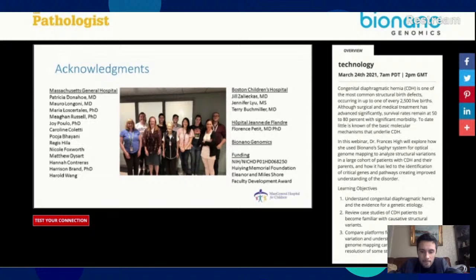Okay, thanks. And in today's world, the size of biopsies are getting smaller and smaller, and several molecular methods are required to diagnose. How much input DNA is required?